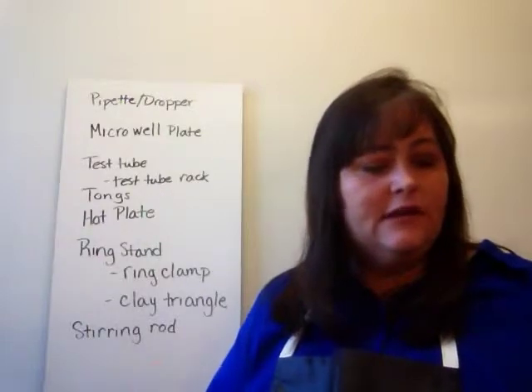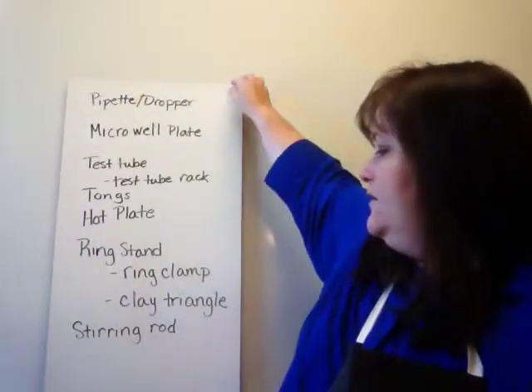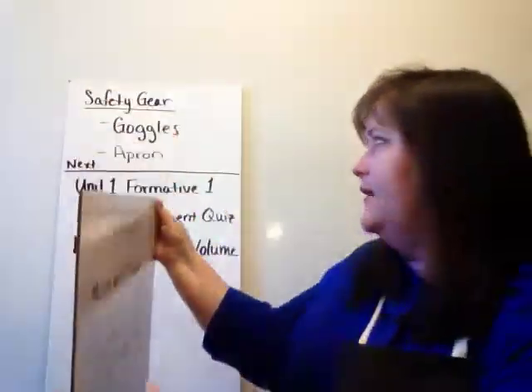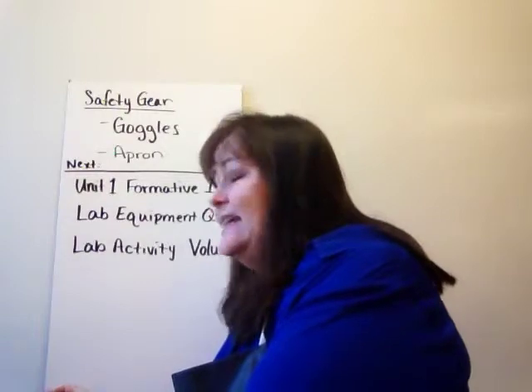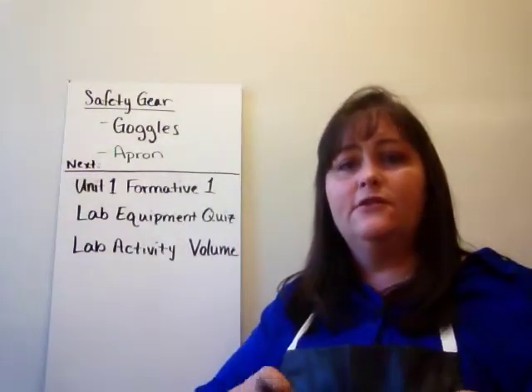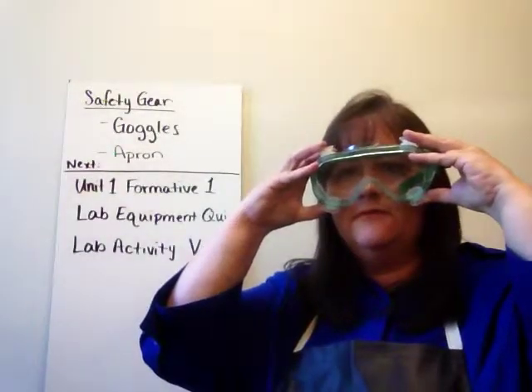When you are using glassware and chemicals or heat, you are going to be wearing safety equipment. Safety equipment includes goggles and apron. Now, don't these goggles look gorgeous? Everybody needs to wear goggles every day, everywhere they go, right?